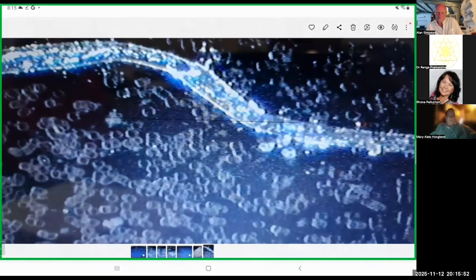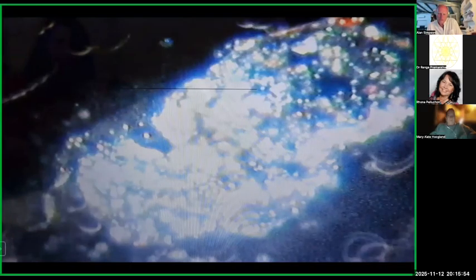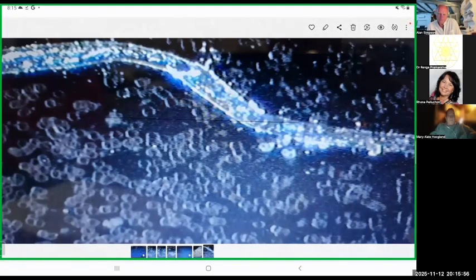Here, this is another one. This is like a big strand of a protein, and inside you can see the small bright crystal. That's uric acid and heavy metal complexes. So these proteins keep aggregating and creating a large, rope-like structure, and compared to the size of the red cells, the small circles outside are the red cells. That is a massive protein. So imagine this going through your arteries. That is very, very damaging.